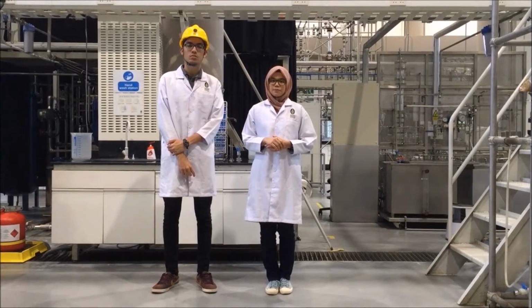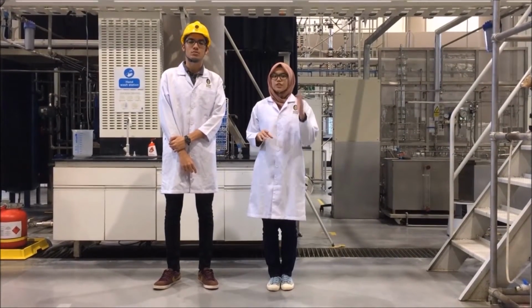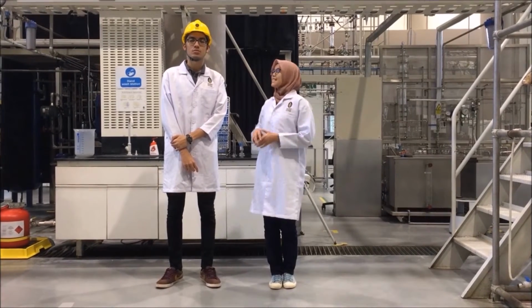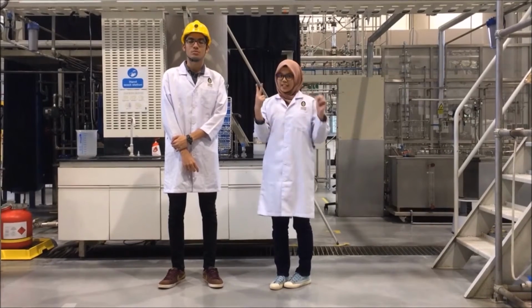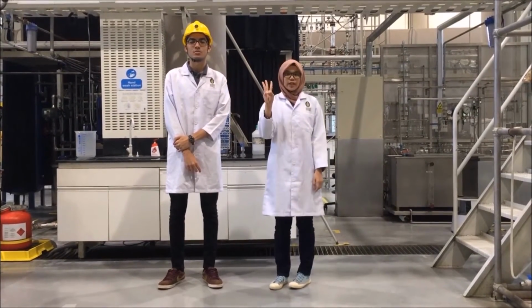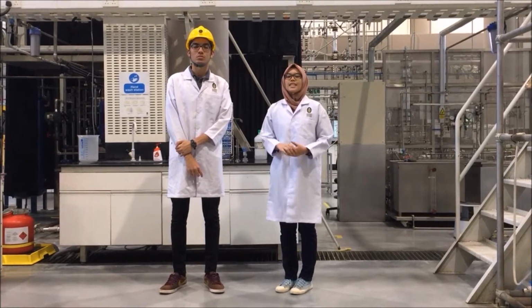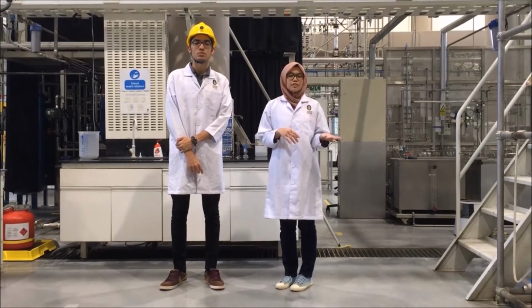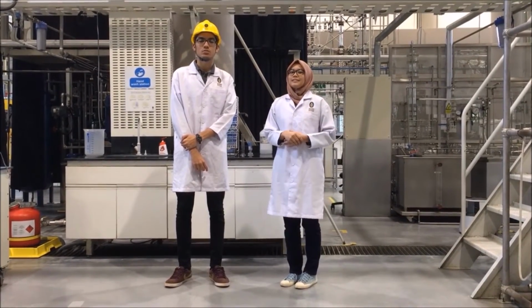Before we conduct the experiment, there are a few safety precautions that you need to follow. First, wear the safety helmet. Second, wear your lab coat properly. Third, wear covered rubber shoes. This is to prevent any damage or injuries which can harm your body.